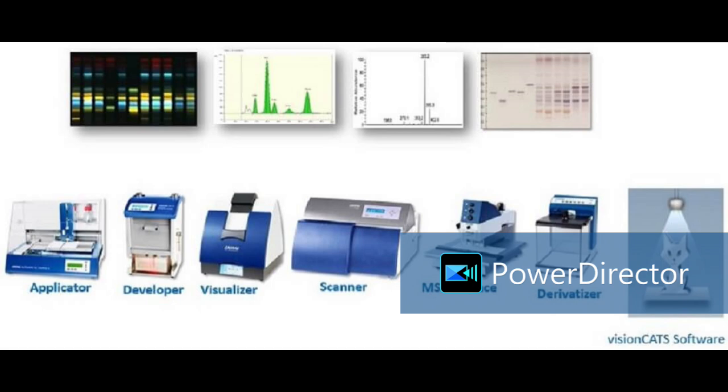So is there a library now? Yes. Library in the sense we will provide you absorption spectra of all this along with these images also. Next time if you develop with the same chromatographic condition, you will get the same RF values and color. So you can see that we have detected a band at so and so RF value. It is matching with literature with codeine, so codeine will be there in your sample.